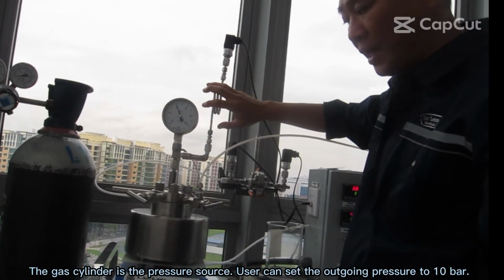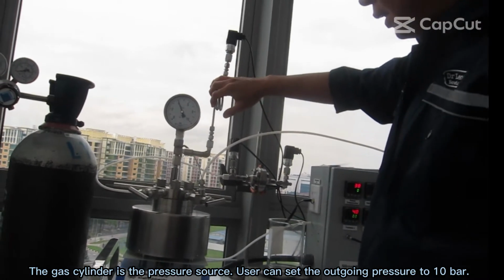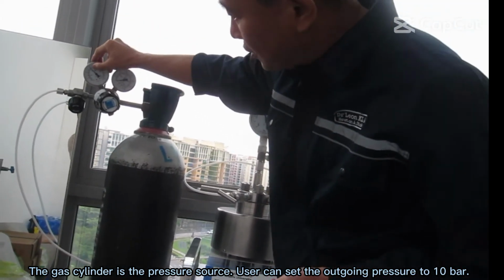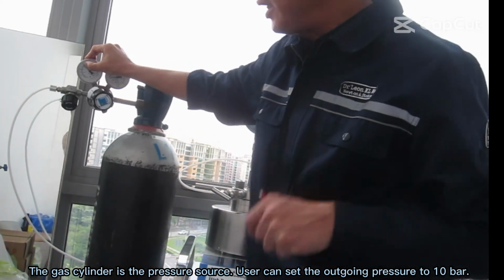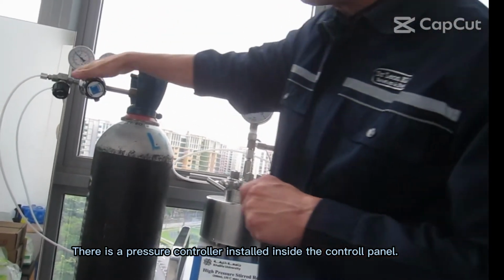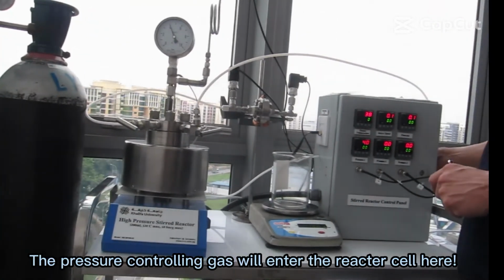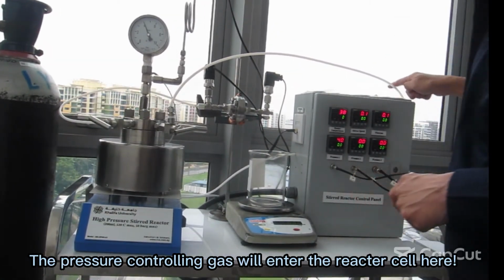The gas cylinder is the pressure source. User can set the outgoing pressure to 10 bars. There is a pressure controller installed inside the control panel. The pressure controlling gas will enter the reactor cell here.